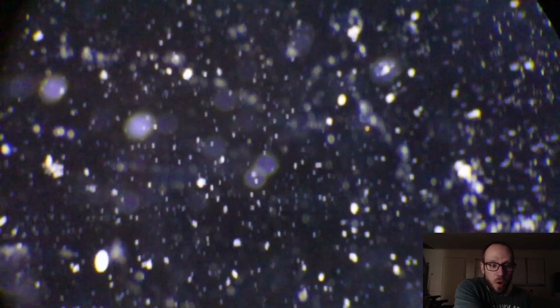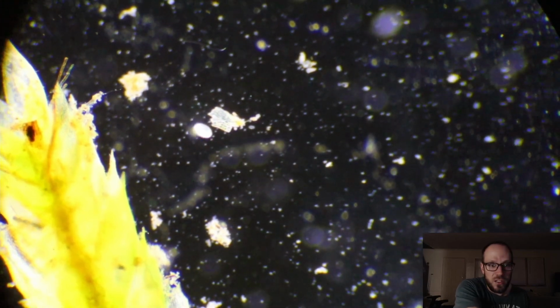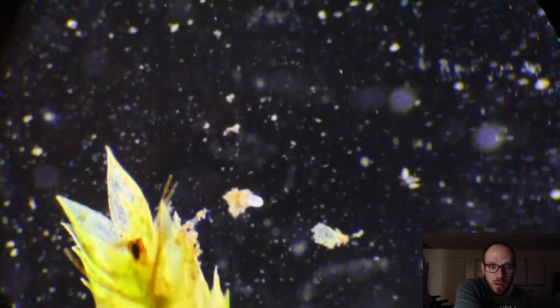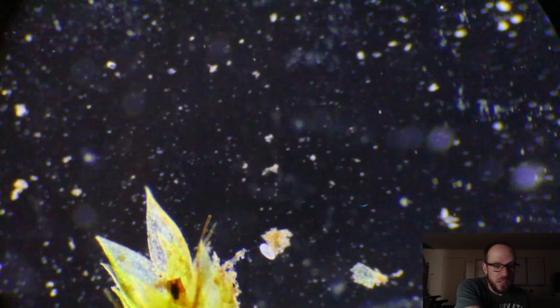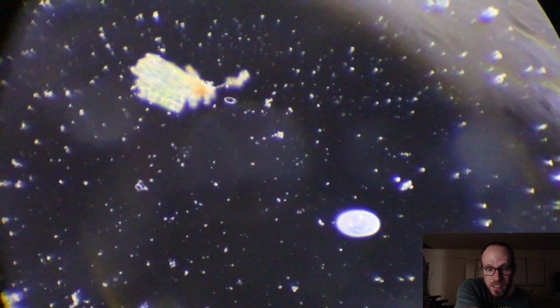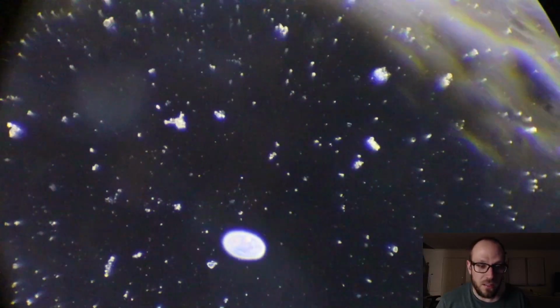Oh, and look at how fat this cell is. I don't know what he is, but he's so cool. I love him. Look at him. He's such a chunker. This is only 40x. Where'd you go, you fat... Oh, my God. He's so fat. You can see little organelles inside him. I think this is the coolest thing ever.